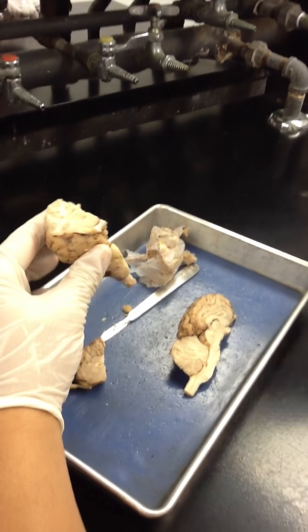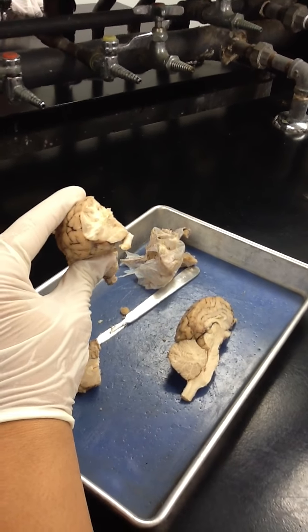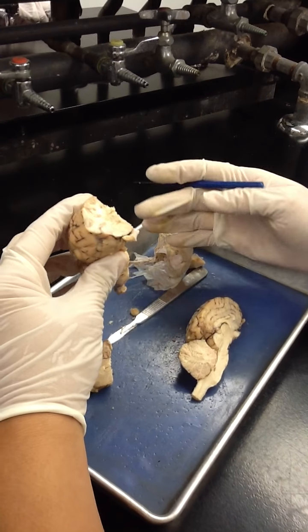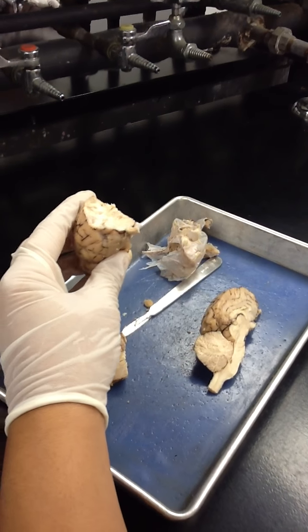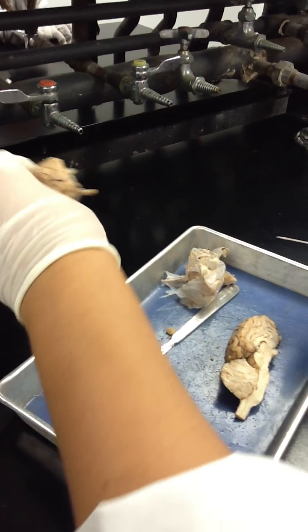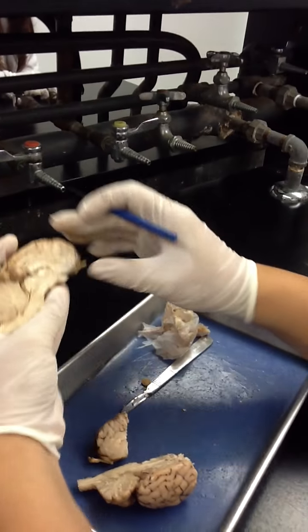So species with more bumps and grooves are going to be, quote unquote, smarter, I guess. Can't really say, but you're intaking more information, right? They're processing more information. All right, so you can see the gray matter on there. So that's kind of cool just to see the gray matter and white matter. Yes? Okay.